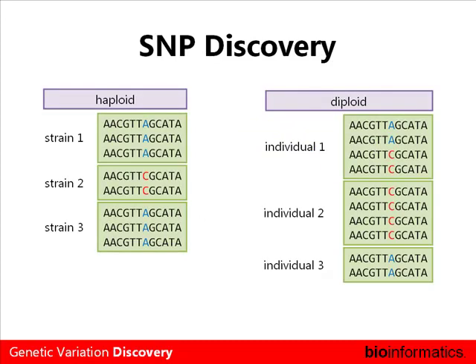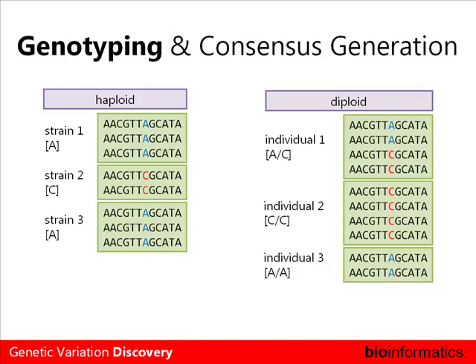As soon as you start looking at SNP calling, you see there are a lot of caveats involved. For example, calling SNPs in a haploid data set versus a diploid data set. This is very relevant in the 1,000 Genomes because you tend to use one program to call the SNPs, but not many people think to consider, if it's a male, doing SNP calling in the X and Y chromosomes as a haploid data set. There's also a big onus on the SNP callers to produce genotype calls, so that's obviously different for both the haploid and diploid variants.